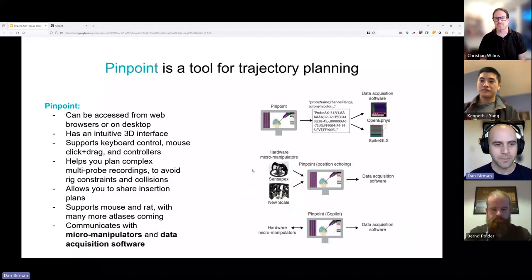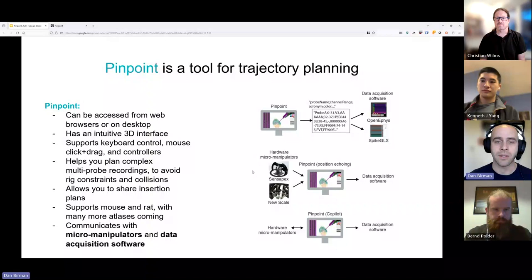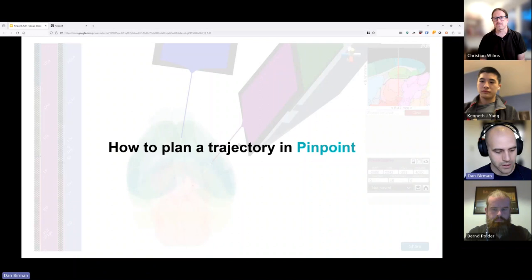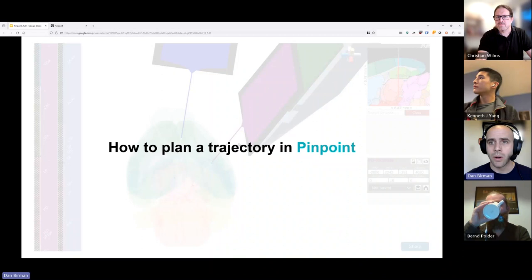The exciting thing with Sensapex is that Pinpoint can talk to micromanipulators, and we can also forward data to data acquisition software. I'll show you quickly at the end how you connect Pinpoint to OpenEphys so that as you move probes in Pinpoint, you see what's happening with them reflected in your data acquisition itself. I'll pause for just a second in case there are any questions already.